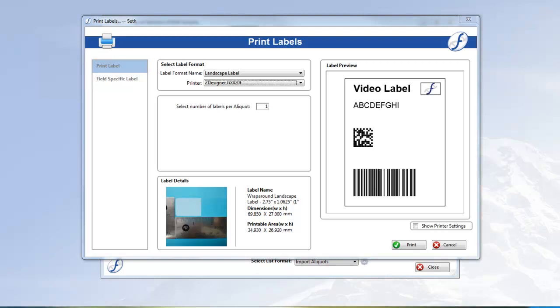If you're here, I'm guessing that barcode labels probably take up more of your time than you'd like to admit. Fiddling with a printer can be frustrating enough, so our hope is that we can make the software side of things more of a manageable experience for you.